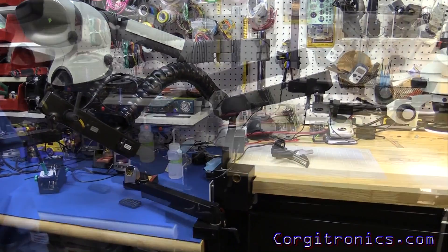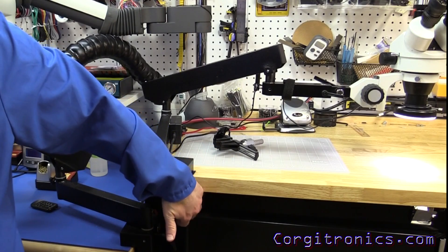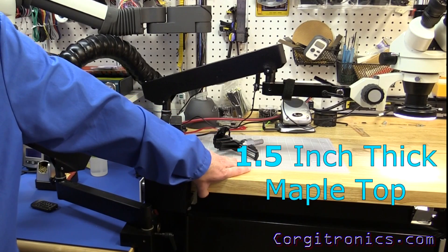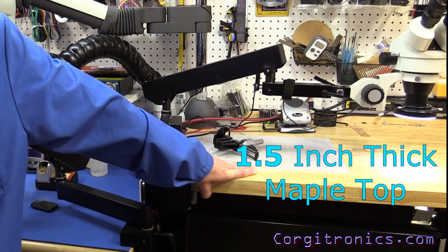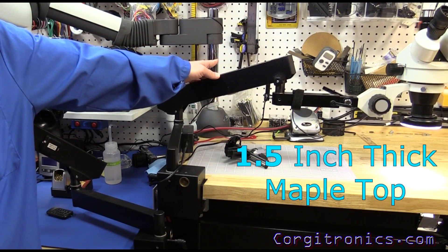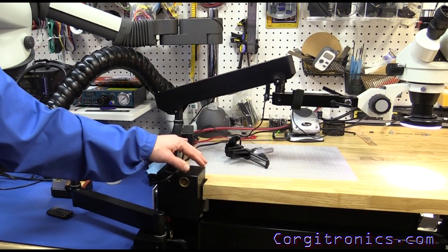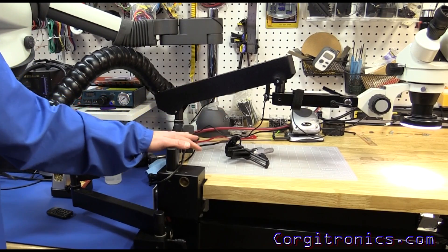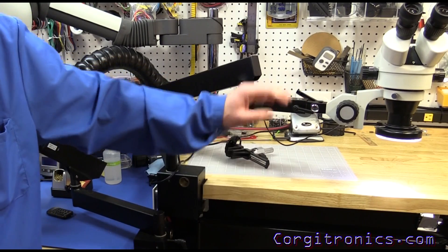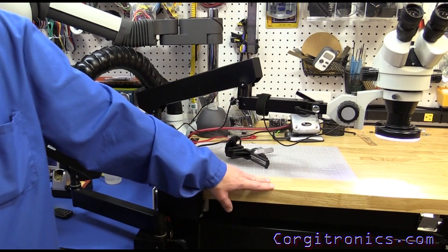One thing to keep in mind: you need a solid surface to mount this to. It has two bolts on the bottom to clamp down to the surface. Here I'm using a one-and-a-quarter inch hard maple top mounted to a steel bench, which is also bolted to the concrete wall at the back. So this doesn't move at all, and any vibration or work here doesn't get transmitted out the arm of the microscope. Because this is a fairly long arm, that movement will get transmitted, so you really need a solid base.